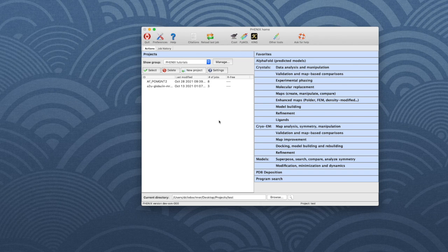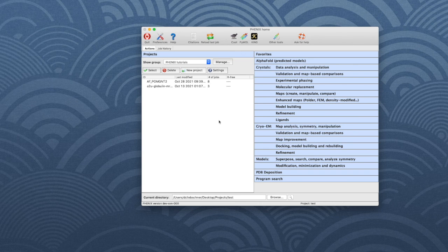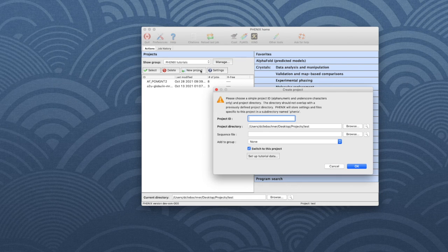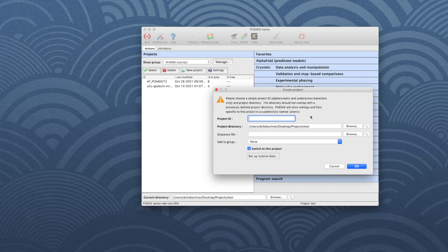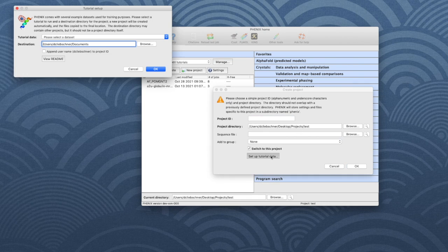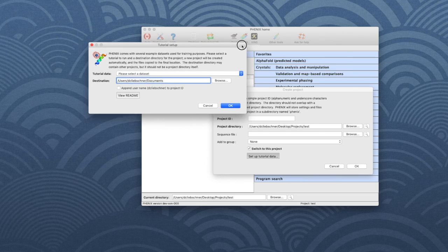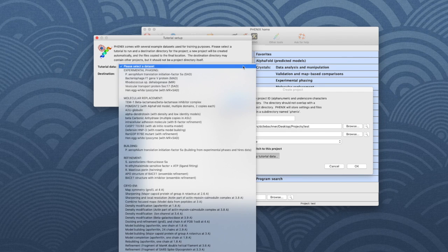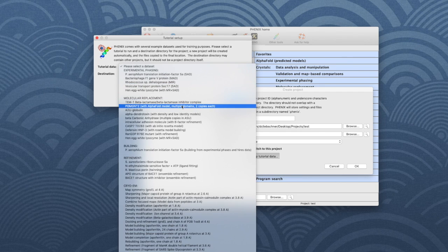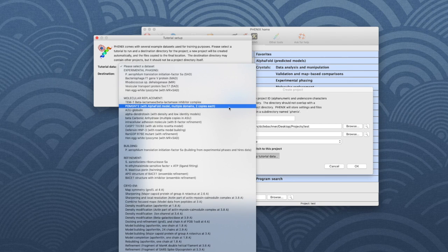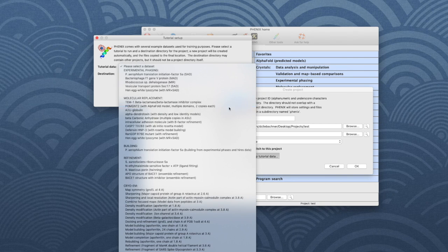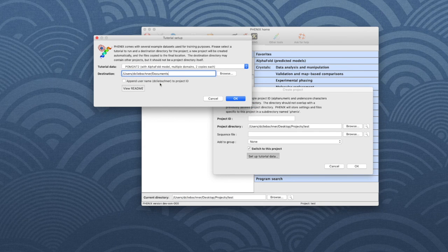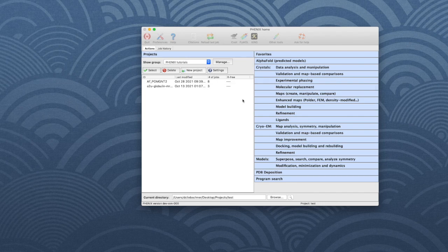To set up the example data, open the Phenix GUI and click on New Project. In the new window, click on Setup Tutorial Data and another window appears. Open the drop-down menu next to Tutorial Data, go down to Molecular Replacement and choose POMGNT2. Indicate a directory where the data are to be saved, then click OK to save the changes.